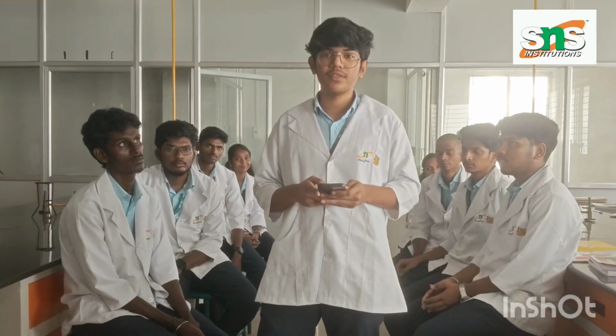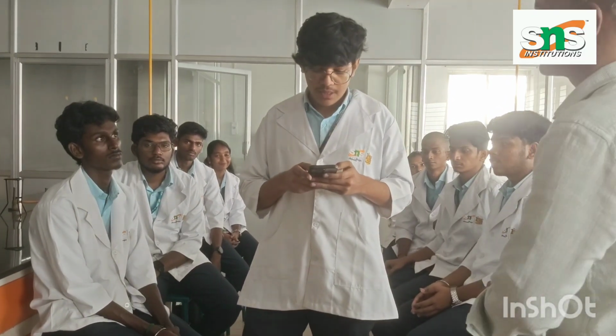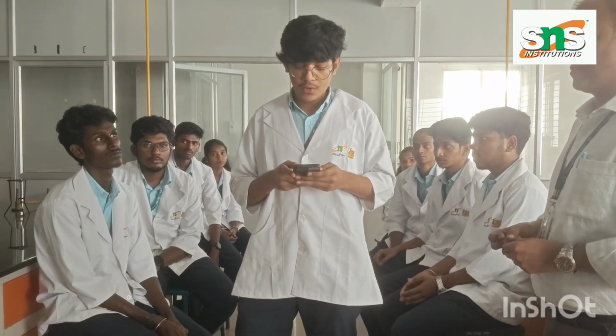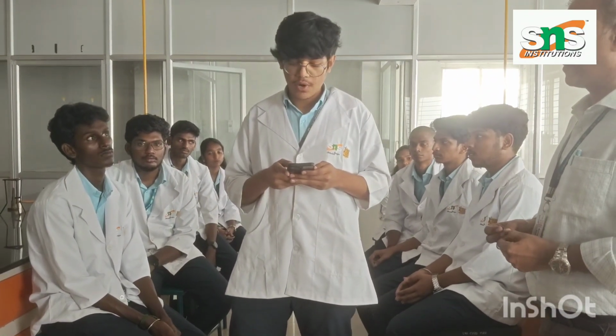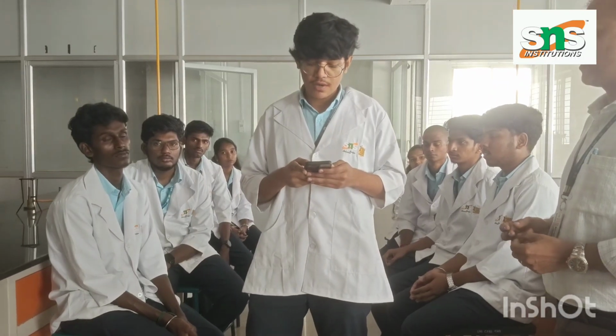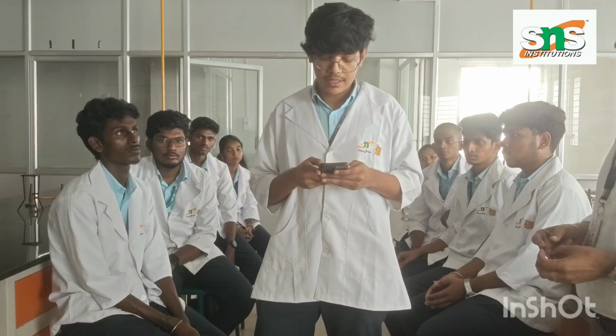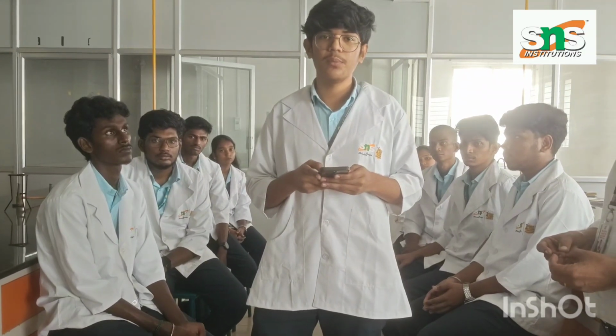Good morning, I am Santoshi. Now I am talking about the prototype of sterility testing. Prototype: simple models or trial versions of the selected idea. Prototypes can be new sterility testing devices, modified lab procedures, or software systems for monitoring contamination. Purpose: to check whether the idea works before full implementation.